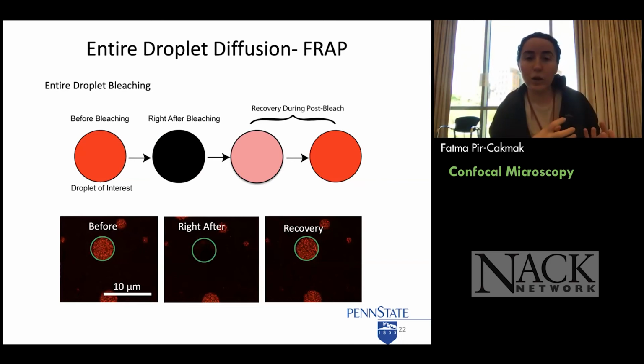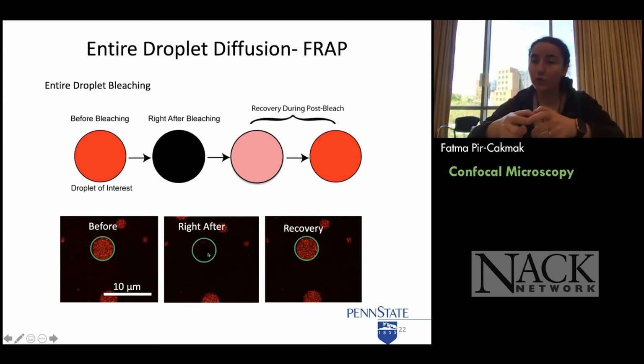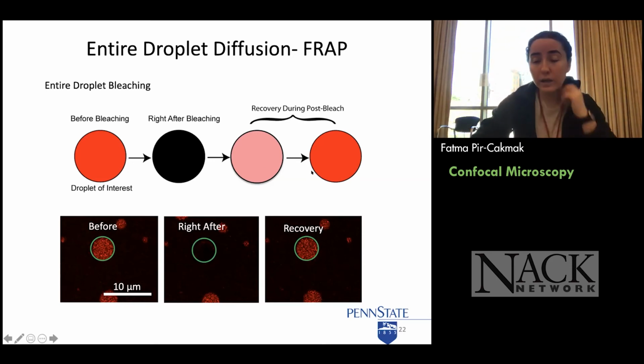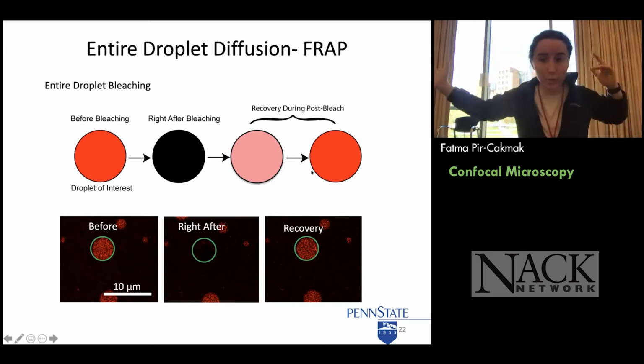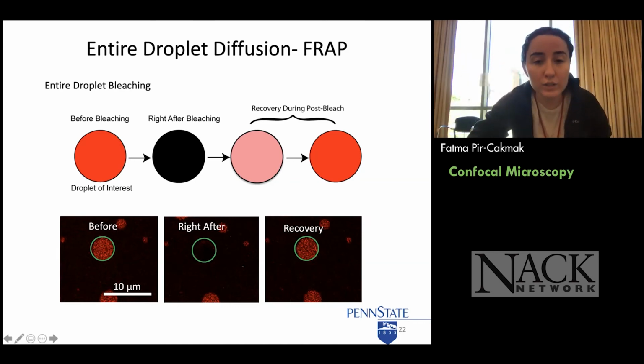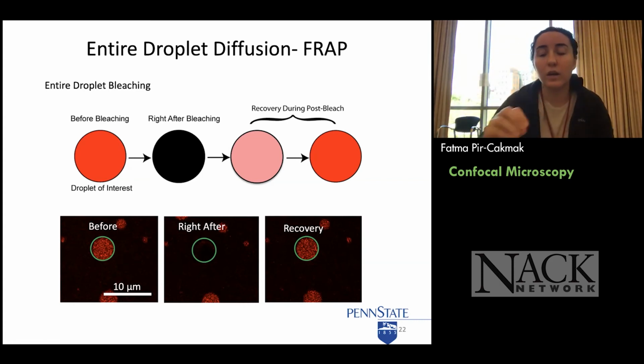The second experiment is entire droplet bleaching. You bleach all of the droplet, using a larger region of interest, which you can choose with the microscope software. Then you look at the recovery again, and this time it shows how the droplets communicate with each other and how other biomolecules come in, because the bleached molecules are not recovering within the droplet.